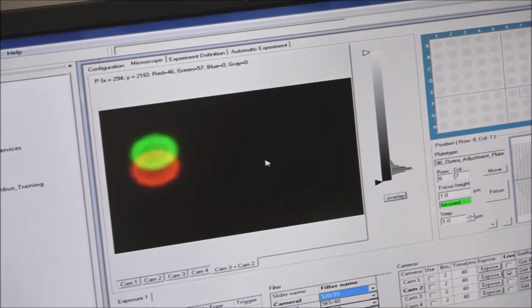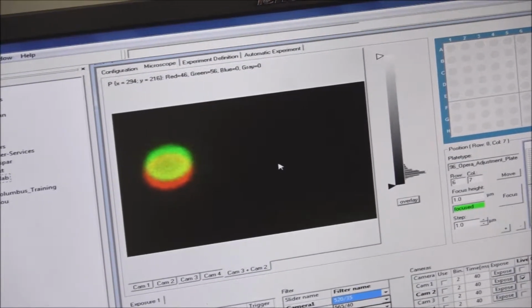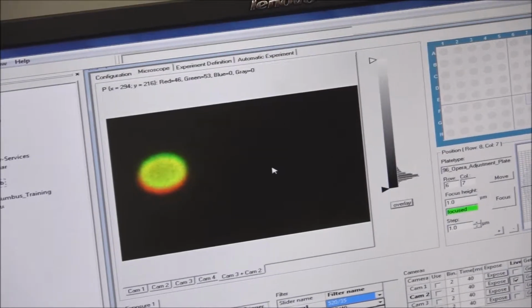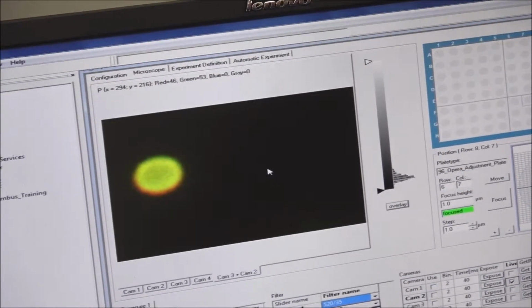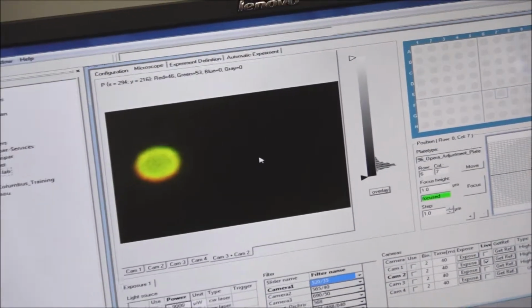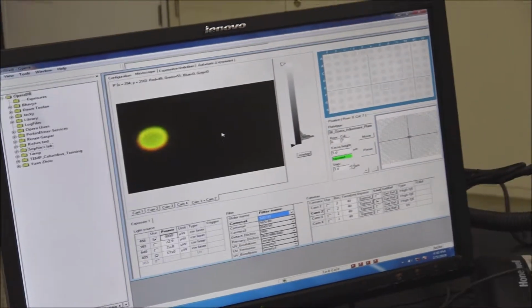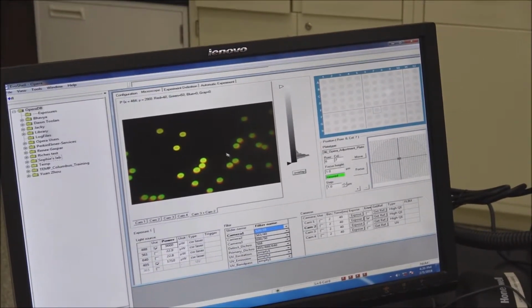All right. It's very, very sensitive. That's why they built in these micrometers to really adjust these. Okay, we're right over top there. I mean, it is about dead on there. Okay, so now camera 2 essentially is lined up with camera 3. You can see it's laying over really good.